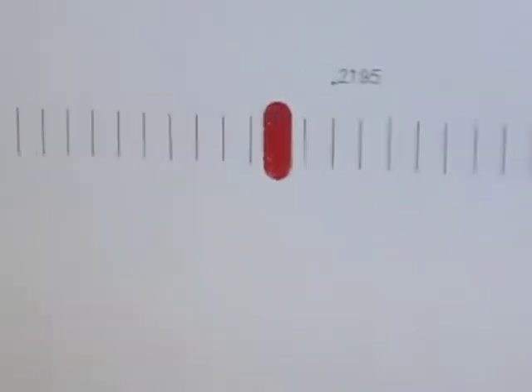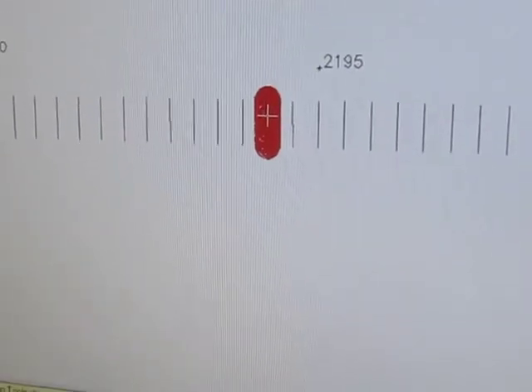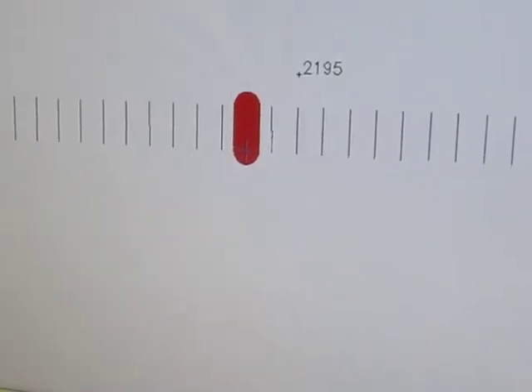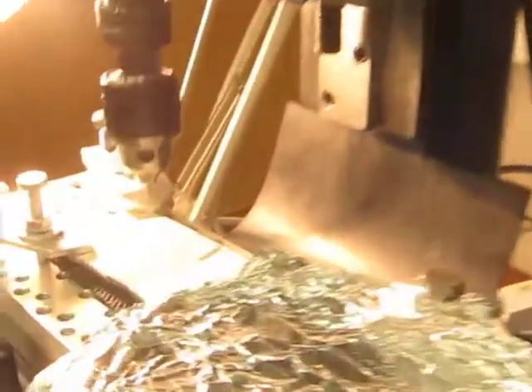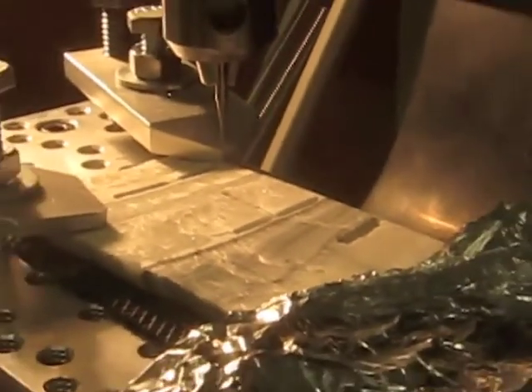You can see on the screen here, now we have this bold red line, that's just indicating the drill's already made its first pass, and there it goes making its second pass. Once this is completed, the drill bit raises back up, and that'll give you time to collect your sample. I'll try to show you here, and again, the quality is not very good, but you can kind of see there's a little bit of powder that's collected. That's the sample that we've just drilled. So the next thing we want to do is collect that sample and get it weighed up and transferred to a vial.